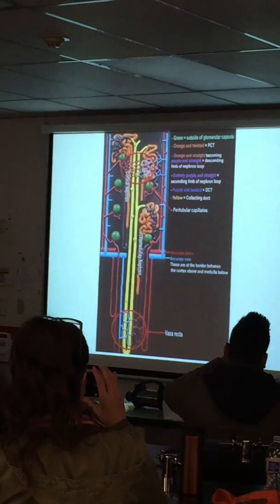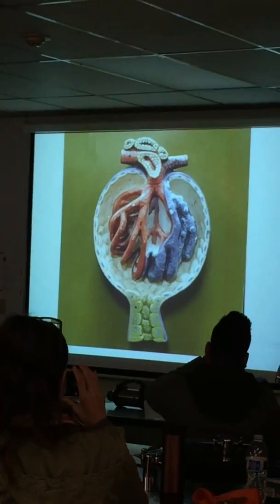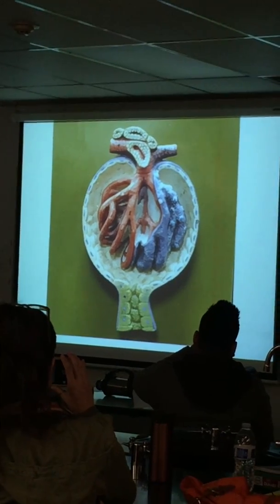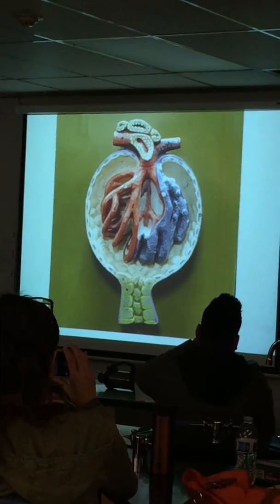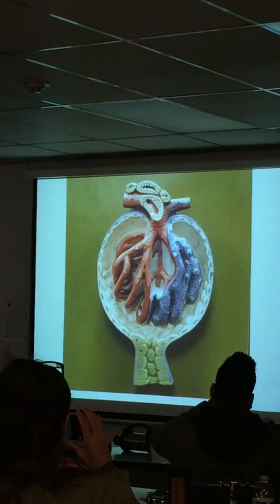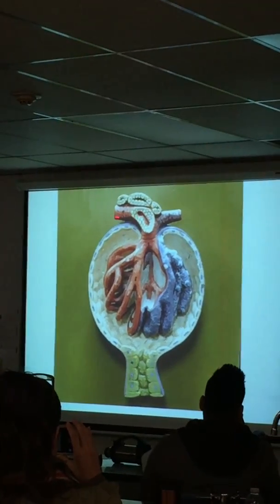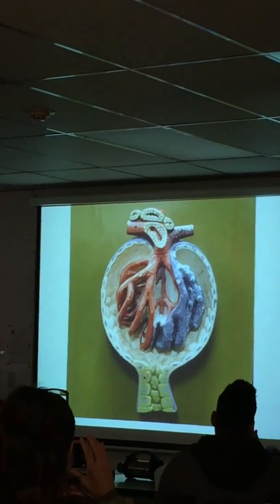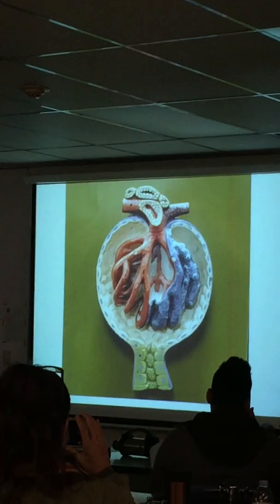It's labeled here, okay? So you can quiz yourself. The renal corpuscle, so you can see the juxtaglomerular apparatus. I'll ask you macula densa and the juxtaglomerular cells, or granular cells. Granular cells right there, specialized cells in the afferent arteriole. So this is afferent arteriole, that's efferent. There's the DCT, specifically macula densa.